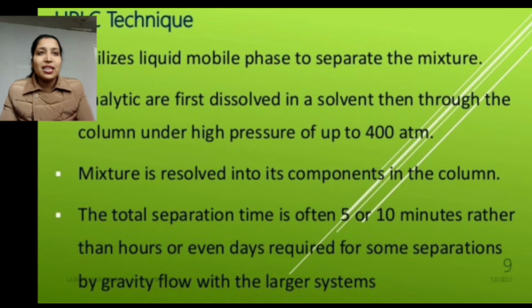So HPLC is of the following types: normal phase chromatography, reversed phase chromatography, size exclusion chromatography, ion exchange chromatography, and bioaffinity chromatography. So these are the types of chromatography.